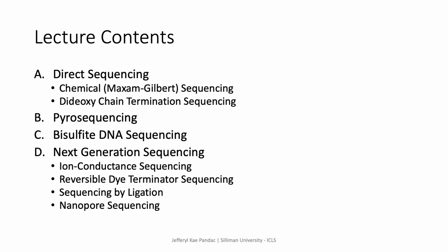This lecture will focus on the following DNA sequencing techniques, as well as the different platforms or formats under it. This discussion includes four major techniques used to determine the nucleotide sequence of DNA. These are direct sequencing, pyrosequencing, bisulfite DNA sequencing, and next generation sequencing.